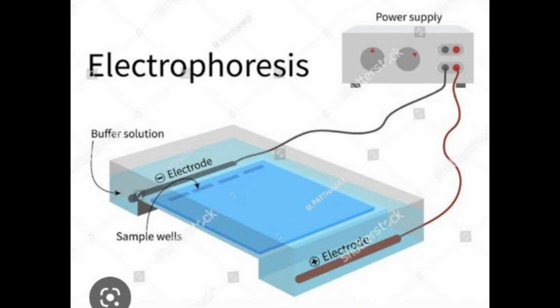Factors affecting electrophoresis. The electric field: the voltage. The rate of migration is directly proportional to the voltage applied between the two electrodes. As the voltage increases, the migration becomes faster, but very high voltage is also not suggested. Current: the rate of migration is proportional to the current. Resistance: the migration rate of the sample ion decreases when there is increased resistance. The movement of the sample ion in an electric field mainly depends on the charge, size, as well as the shape of the sample molecules.